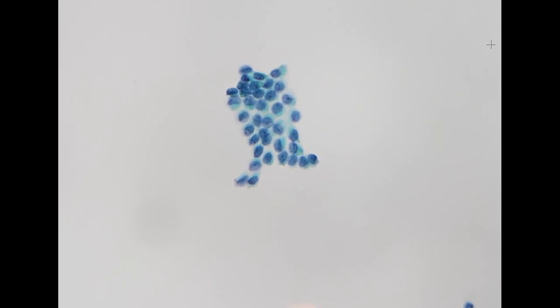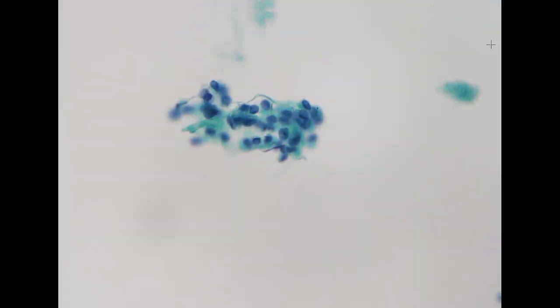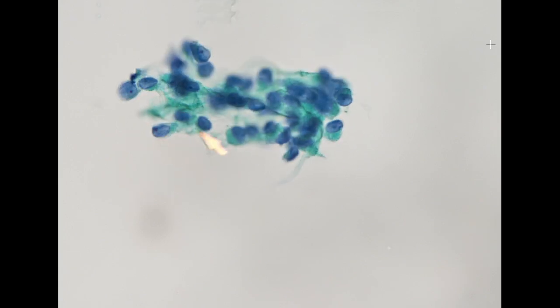So based on this morphology, the cells are highly suspicious for papillary thyroid carcinoma. So we only have a few clusters of cells. Again, these also demonstrate features of papillary thyroid carcinoma. We only have a few cells. We do not identify any pseudo inclusions, and the sonographic finding was equivocal.